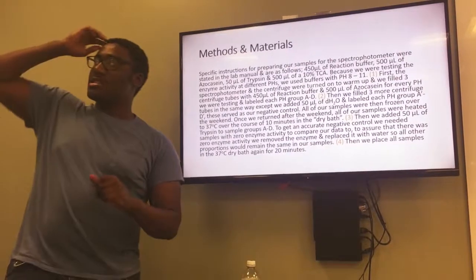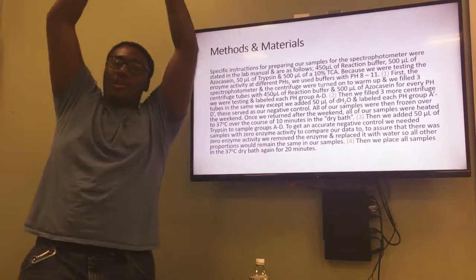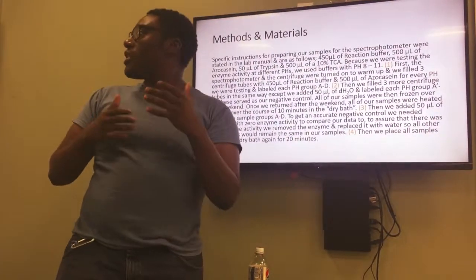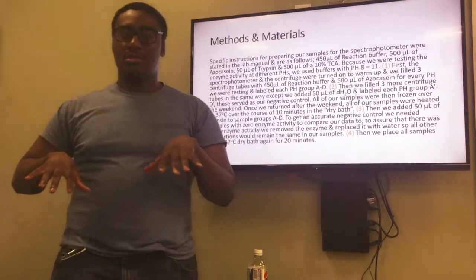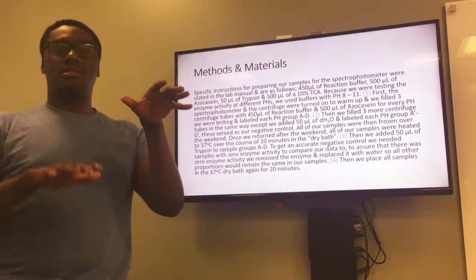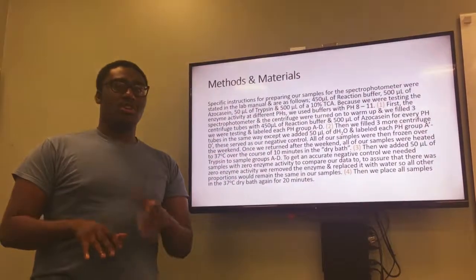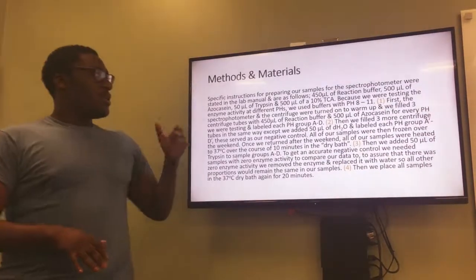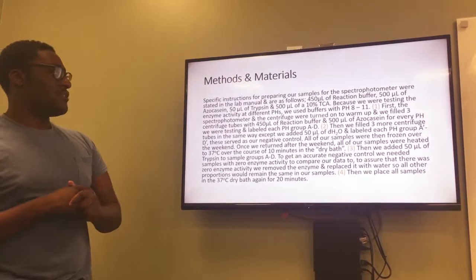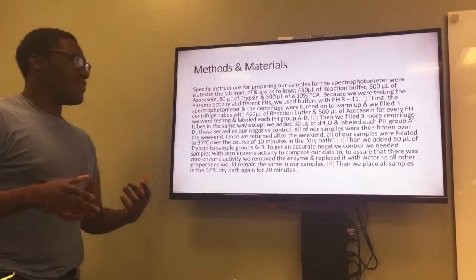Now, TCA stops the enzyme reaction, plus it helps separate the enzyme from what it's digesting so that we can actually see the enzyme and not the enzyme plus what it's digesting. Because we were testing the enzyme activity at different pHs, we had the buffer between pH 8 to 11.